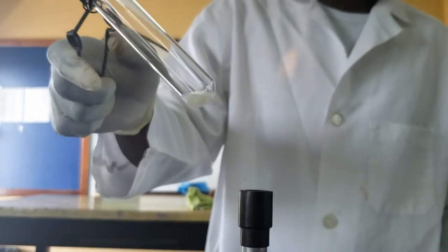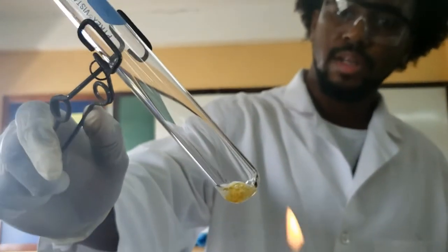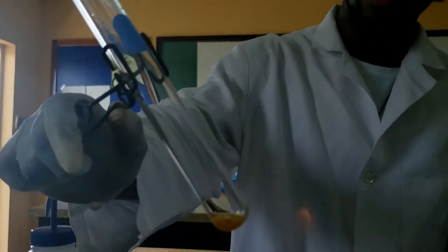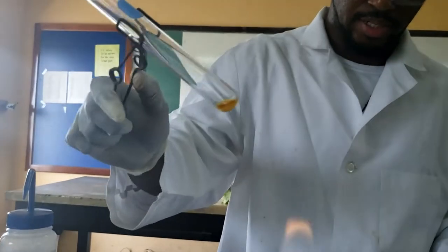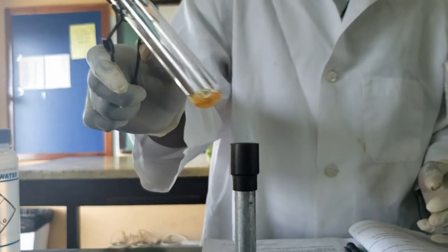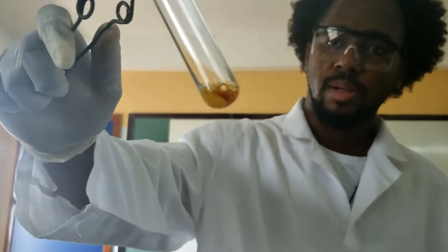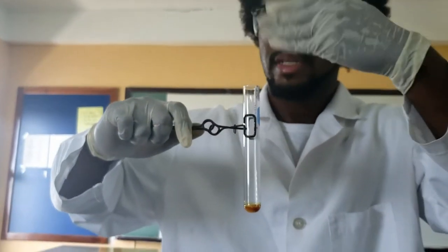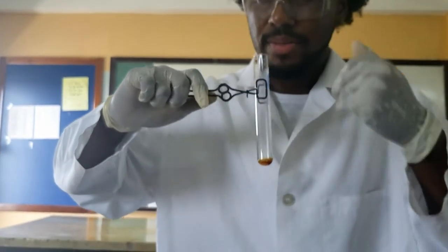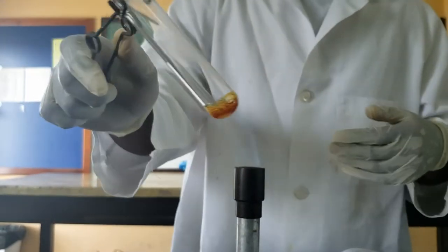Always remember to point the boiling tube away from you or any of your partners — you don't want to injure anyone. You can see the sugar starts to change color; it's becoming molten, and there is some gas coming off from the tube. As we continue to heat more strongly, it goes from a yellow to an almost red-brown color. And if you would take a waft of that smell, we get that sweet caramel smell — if any of you make syrup at home, you should be familiar with that smell.